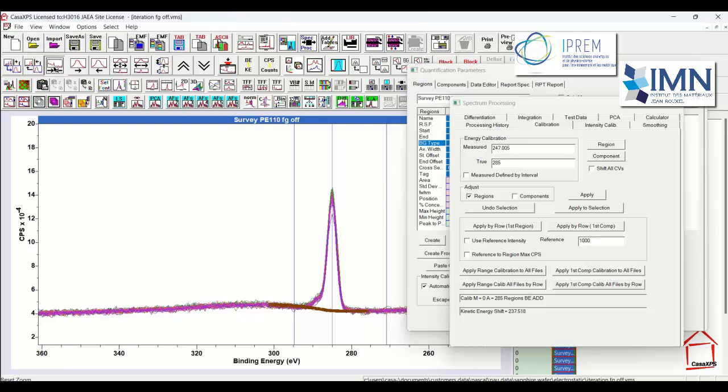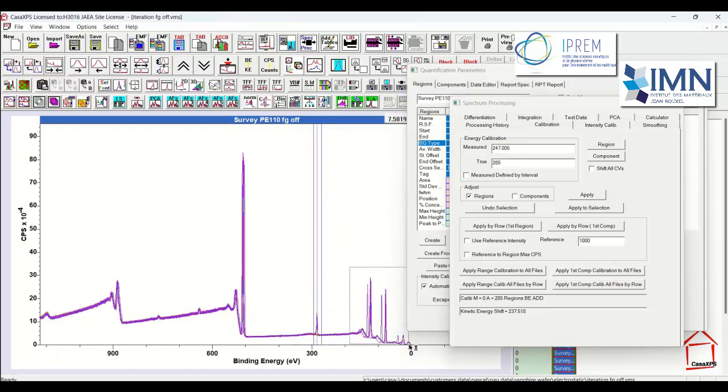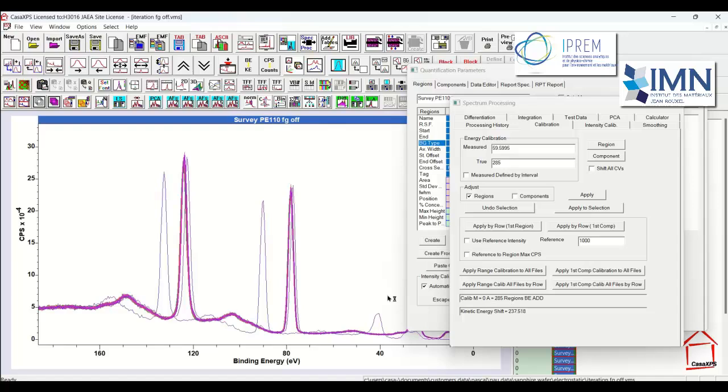So how bad could it be? Well, it can be quite bad. Despite having aligned these peaks, you can see that some are not aligned. So the very first measurements that were performed, we do not have a good energy scale. It's non-linear. It's not a constant offset between peaks, because that's what the assumption was, that there would be a constant offset between peaks that we could correct for by the calibration step, and that's just not true.